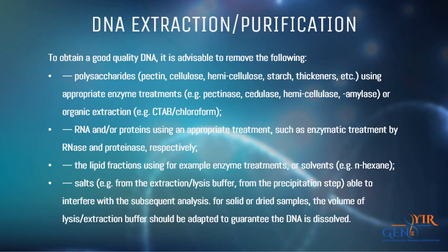and by adsorption on solid matrices, anion exchange resin, silica or glass gel, diatomaceous earth, membranes, etc. Several DNA purification principles may be combined. If appropriate, extraction and purification can be performed within the same step. When using vacuum freeze dryers to dry the DNA pellets obtained after a precipitation step, the risk of cross-contamination should be considered. Resuspend the DNA in water or in a buffer solution that prevents DNA from degradation.